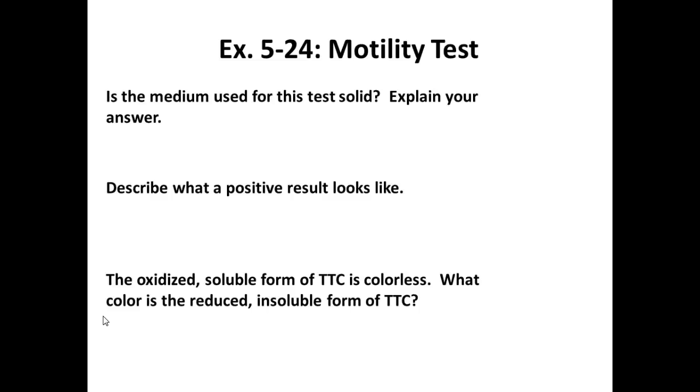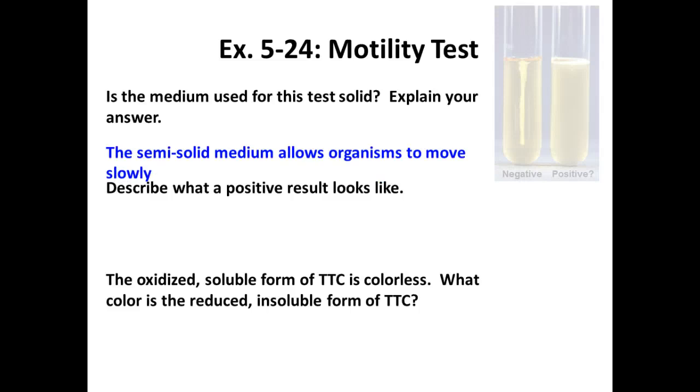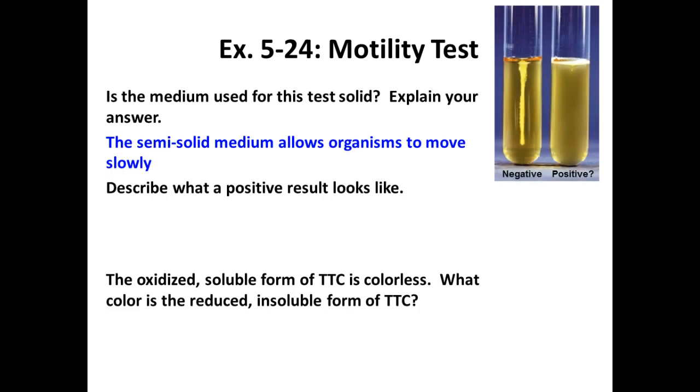One of the problems with this test is that some things can go wrong, so more than one test will give us more accurate information. Is the media used for this test solid? The answer is no. It's what we call semi-solid. If you were to touch it, in comparison to what we pour into plates, or even those slants, this one would be squishier, because there's less agar, less of that solidifying agent in the media.